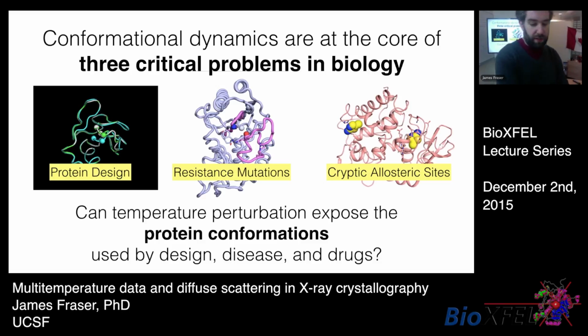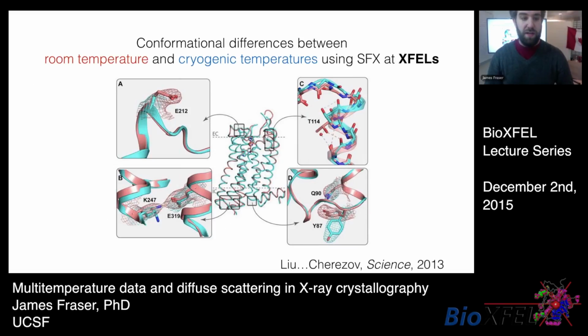crystals. I would point out that even their synchrotron data set is somewhat of a serial crystallography approach, in that it required the merging of multiple crystals frozen in the LCP mixture. But this must be a general problem when you're looking for very small conformational changes. You've got to know that the chemistry is identical in forming them. Yes, certainly. Any temperature is an important global perturbation, but so is the mother liquor, the pH, all of those aspects.